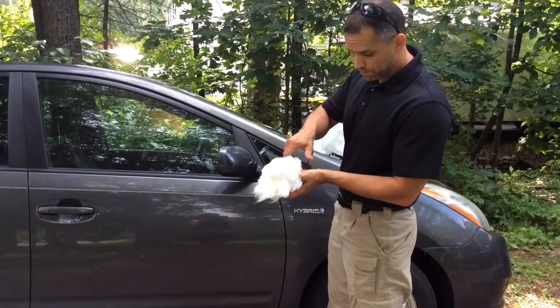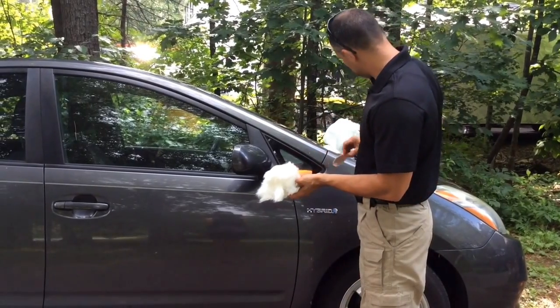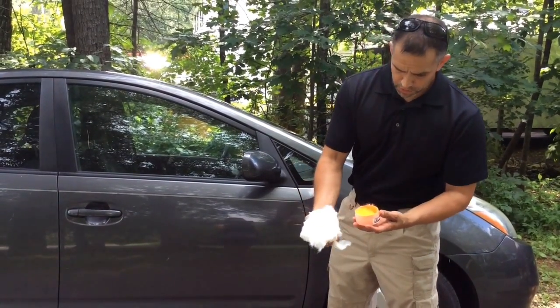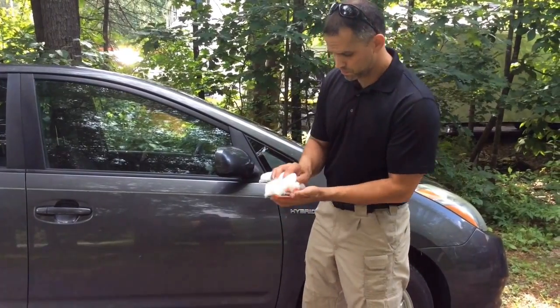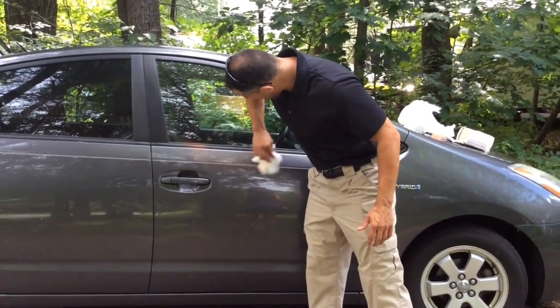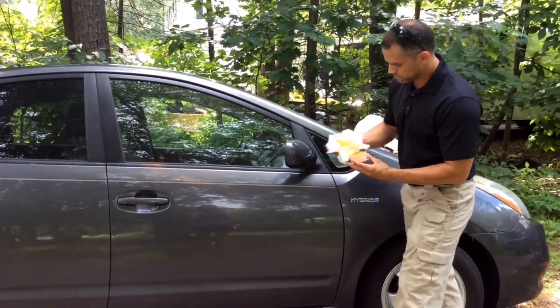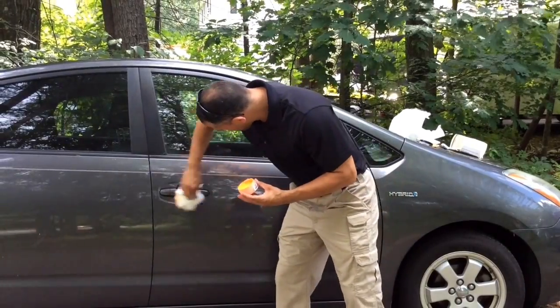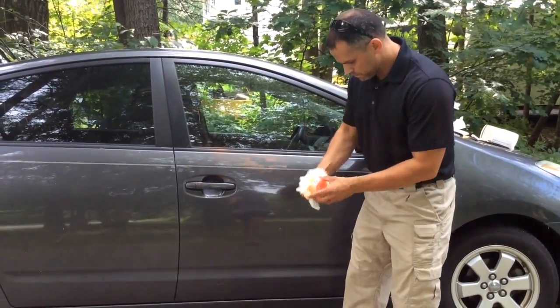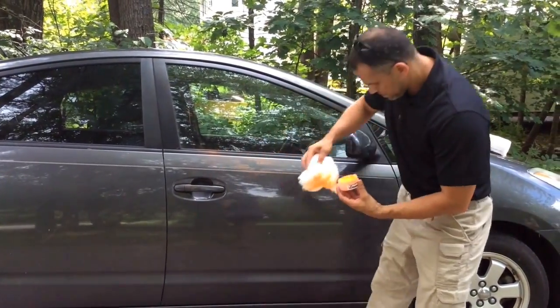I'm going to start with the orange powder — again, high quality powder. You can see I put the powder on the cotton. I'm just going to go right over to the car and very lightly dust the car. I need to put some more on. I can see some beautiful prints showing up right here on the door handle. We can do the whole car.